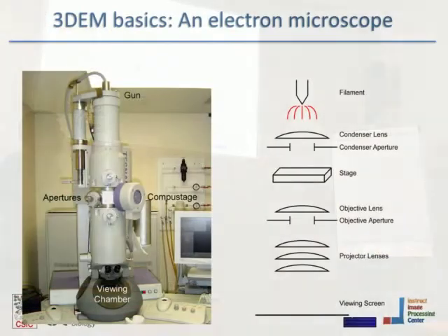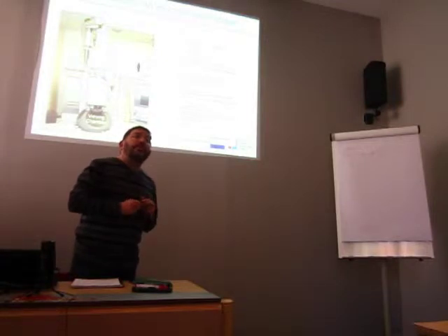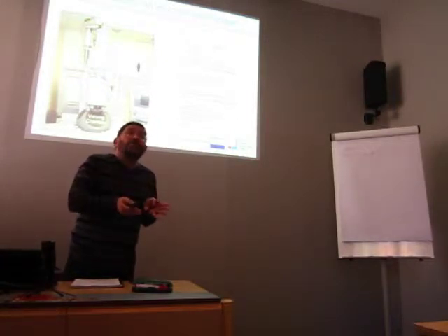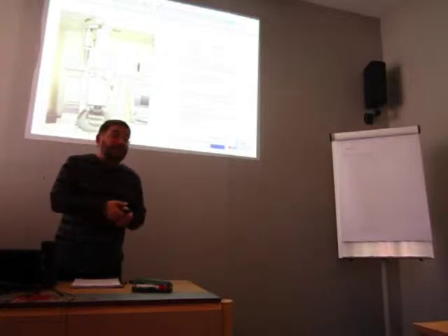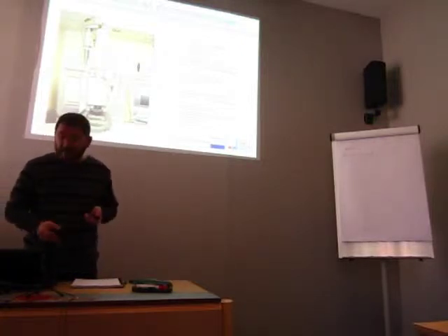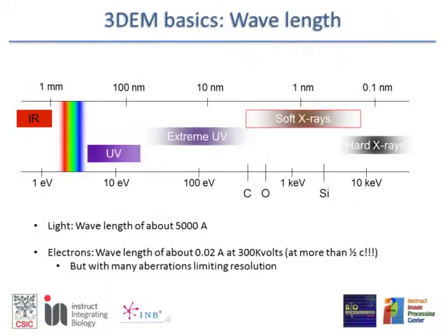And this interaction is actually dictating how these images are going to be formed, and how these images are formed dictates how you are going to treat them. It's very obvious. Depending on the interaction of the radiation with the specimen, there is some information that is learned about the specimen, and we have to derive that information from the images.